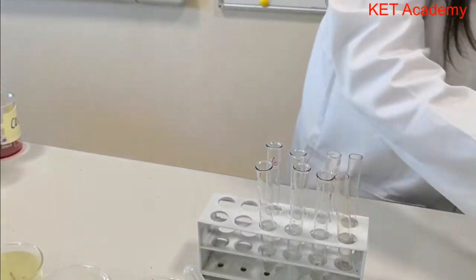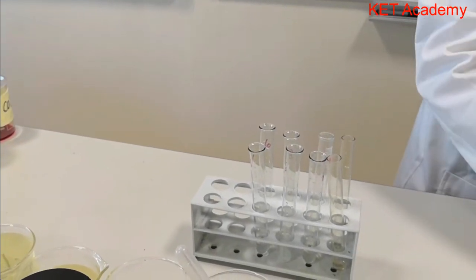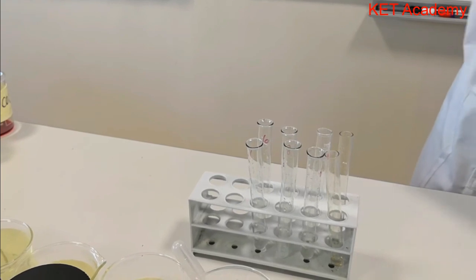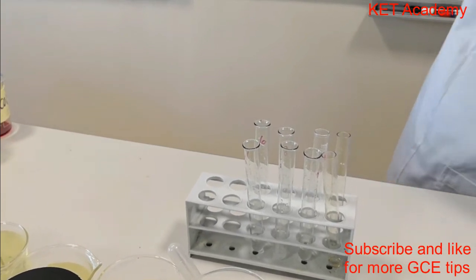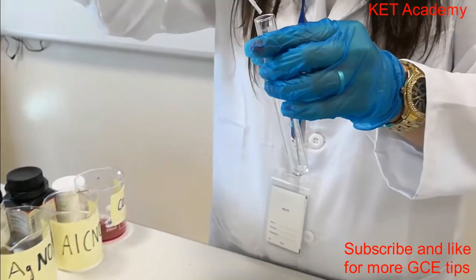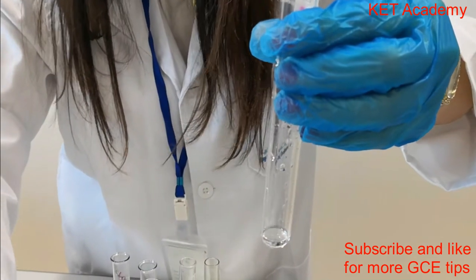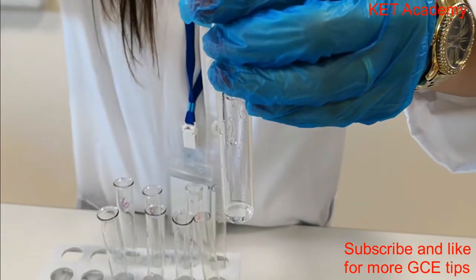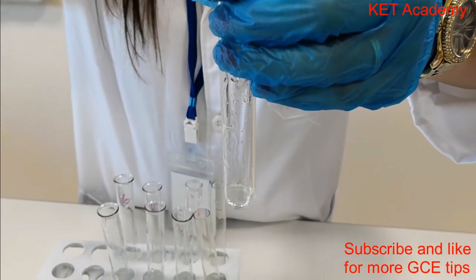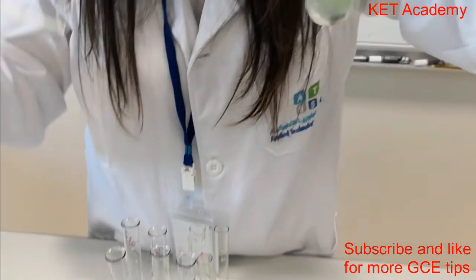Now let's try this with iron. Okay, a solution of iron 2, Fe2+. This is iron 2 solution with drops of sodium hydroxide. It's green.